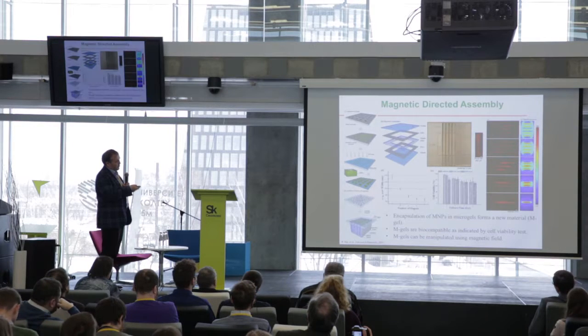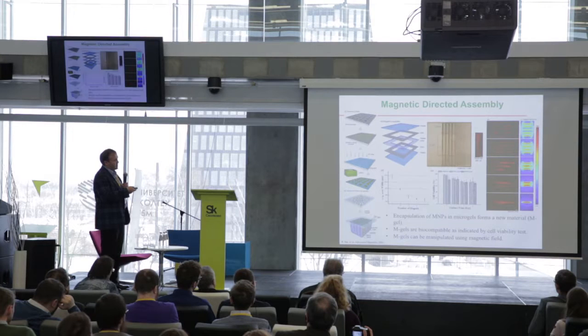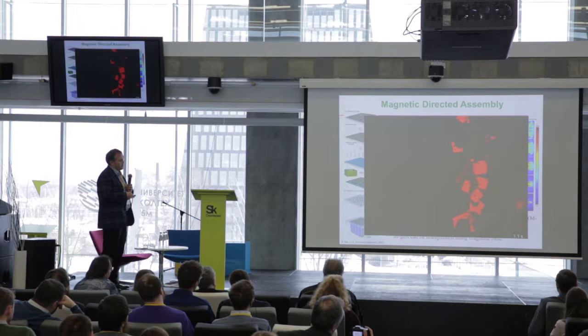This is a simulation of a magnetic field distribution in a chamber like this, 1, 2, 3, 4, 5 magnets. And when you load your magnetically active, paramagnetic ion-loaded gels, they will just go ahead and align on these maximal magnetic areas. And this is like real-time what's happening.